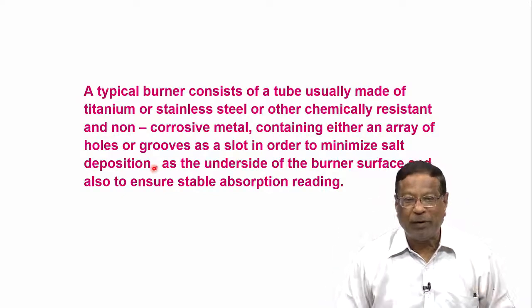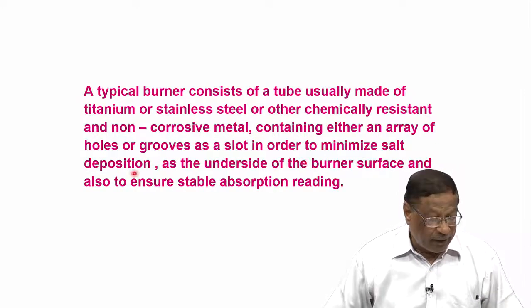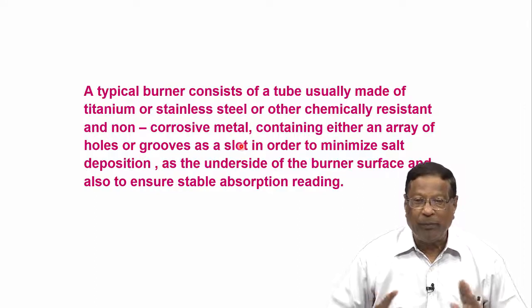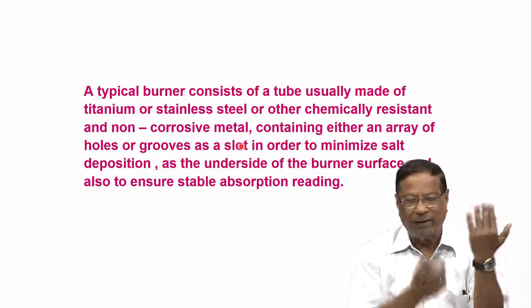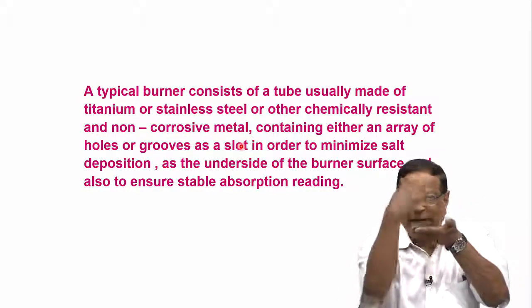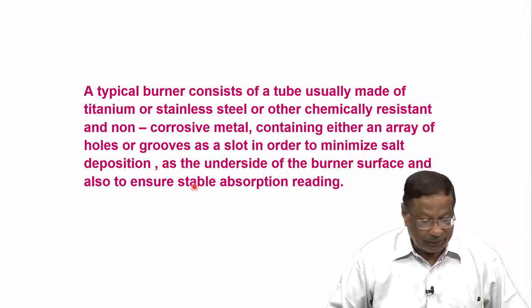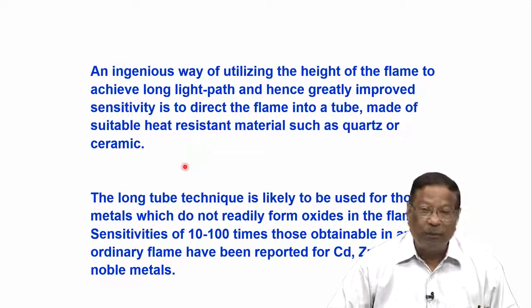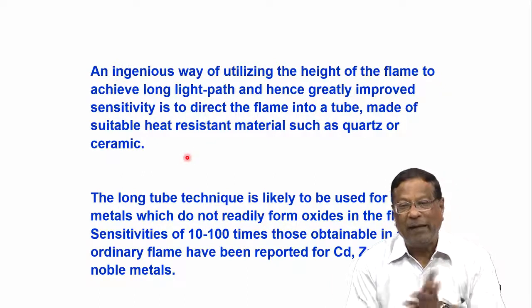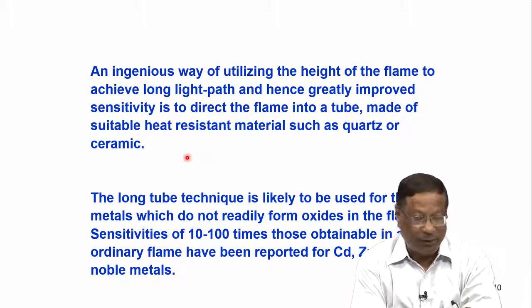So, in order to minimize salt deposition, on the top we make a number of holes, something like this, through which the gas will enter. It also leads to stable absorption reading. But all said and done, the turbulent burner is not an ideal burner in most systems in atomic absorption.